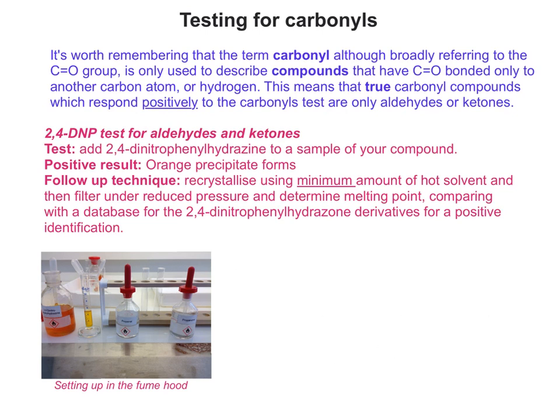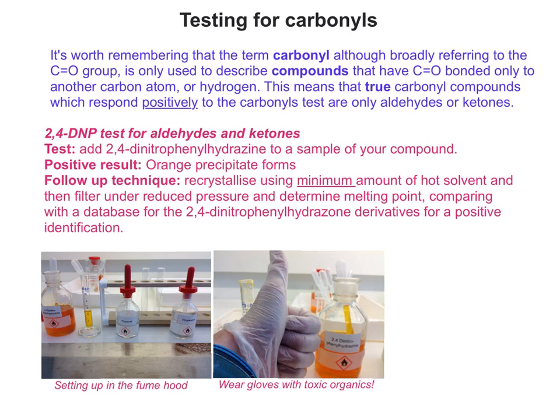So we start by assembling all of our materials in the fume hood. All the compounds we're talking about are toxic and flammable to some degree or another. Particularly the 2,4-DNP, it's very toxic indeed, so you have to wear gloves when you're using it. It's actually a common precaution with many organic compounds. The safest thing to do is to assume that they're dangerous to come into skin contact with, so you just wear gloves automatically as well as your lab coat and your goggles.